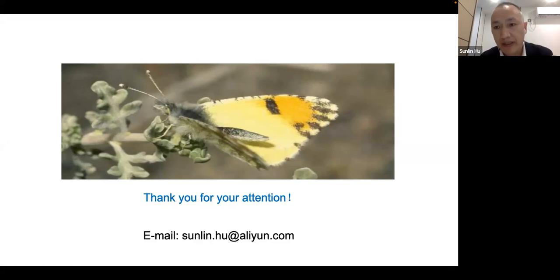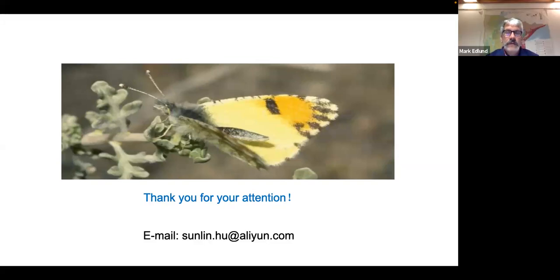The body has to be washed completely, not only with tap water, but also with diatom-free purified water, because diatoms can be detected in tap water. Do you understand?